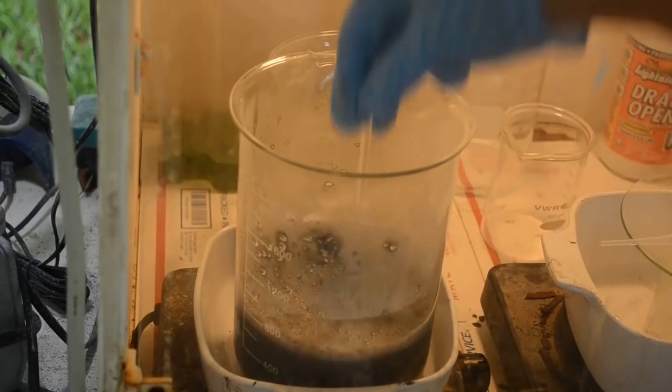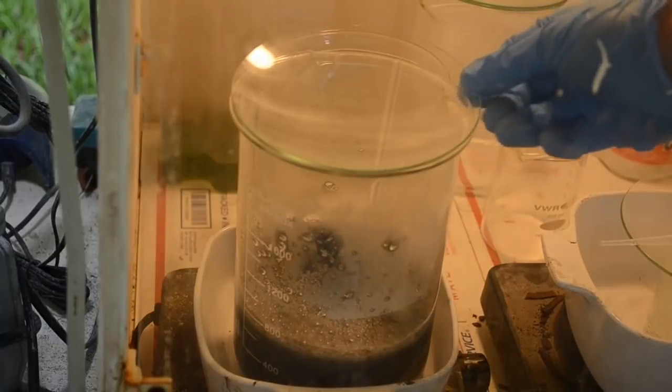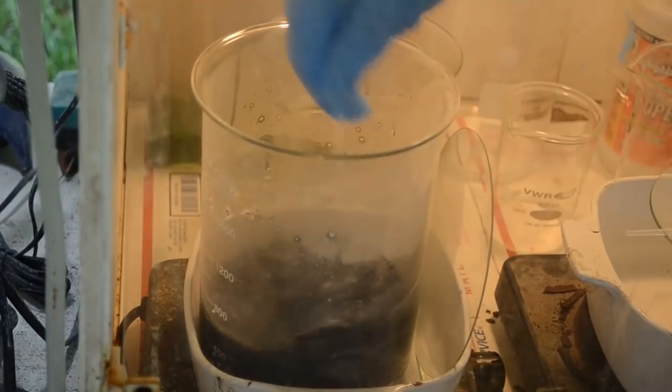So I'm just gonna let this sit here for a while and let the acid do its thing and digest the rest of the zinc in there that was not used up in the cementation so we can get rid of it. Well, it's been a little while. I've been stirring it.